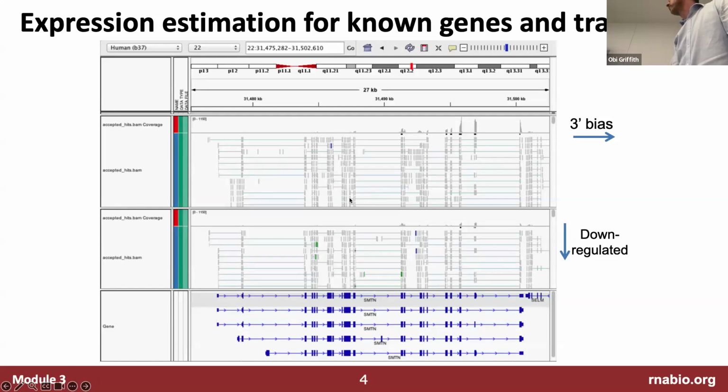And you can already start to infer some things just from this kind of high-level zoomed out view of this gene, right? So one of them is that there's a lot more coverage up here, right? So this thin track up here is giving you a sense of coverage. And I think they're set at the same scale. So these bars are higher up here for this sample than down here for this sample. If you were to scroll up and down in this alignment view here, you would see that the reads run out much sooner. There's a lot more reads going down here, and that's reflected in these coverage estimates up here.